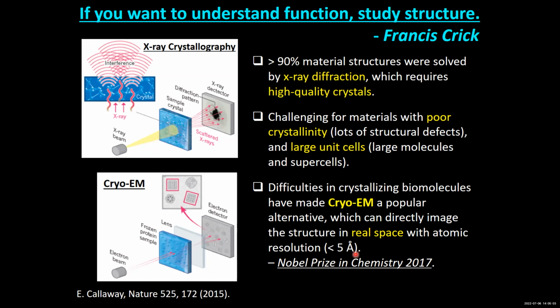That is reflected by the recent success of cryo-EM, which has already been used to solve hundreds of structures of biomolecules that are difficult to crystallize. So it won the Nobel Prize in Chemistry in 2017.